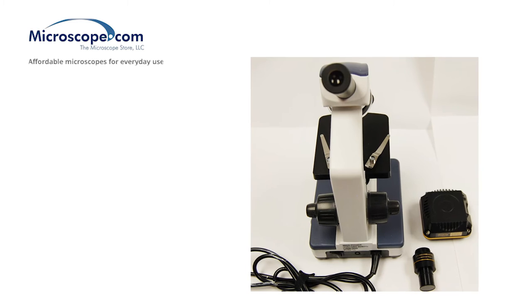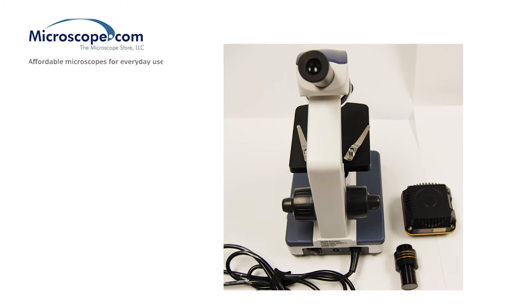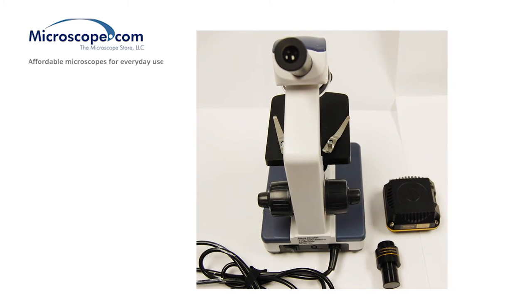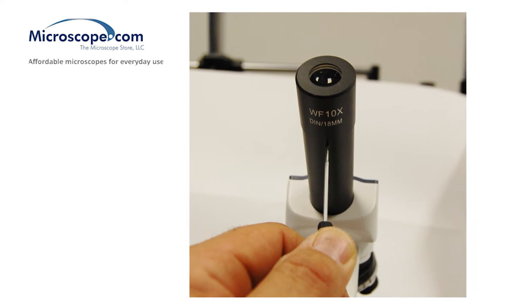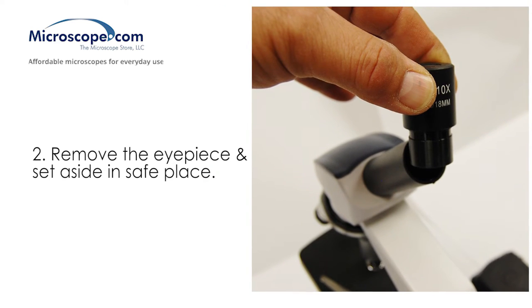This adapter replaces the existing eyepiece, or simply slides into an open trinocular port if one is present on your microscope. Your existing eyepiece should slide out freely. If it does not, you may have a small set screw retaining it. Use a very small screwdriver to loosen this screw or remove it. Remove the eyepiece and set it aside in a safe place.